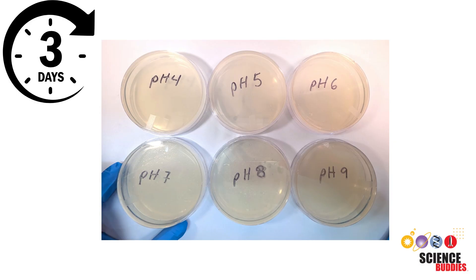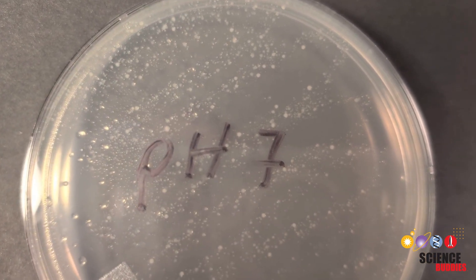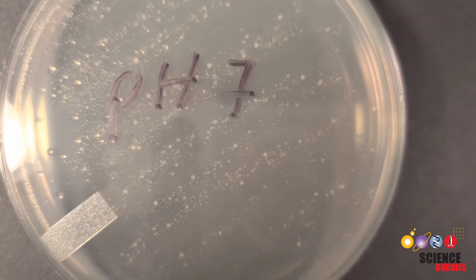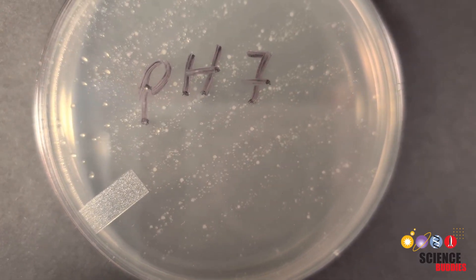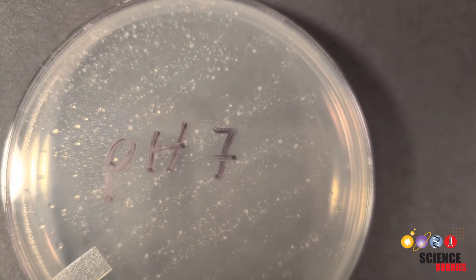After you are done preparing all six agar plates with your water samples, place them somewhere out of the way at room temperature, upside down, and check on them each day for three days. You should end up with little colonies of microbes growing on your control plate. The control plate is going to be the same pH as the pond sample, probably right around pH 7. As you can see here, we've got lots of colonies, which are kind of whitish in color, growing on this plate, so it successfully cultured those microbes from the pond.